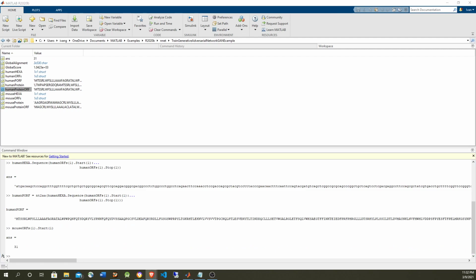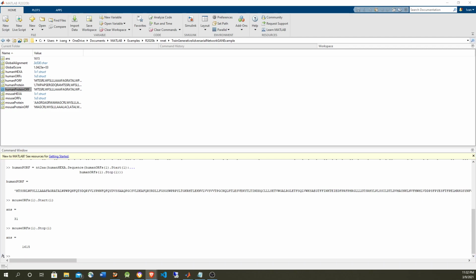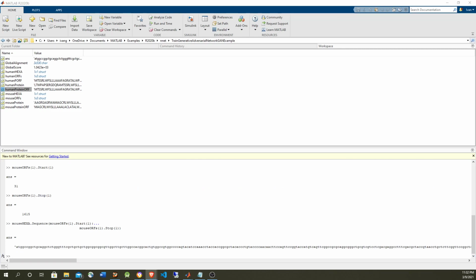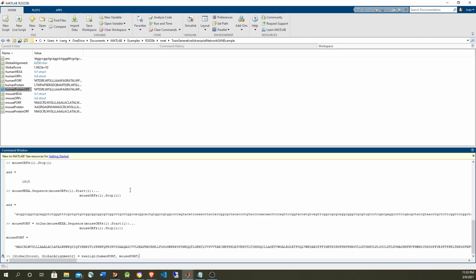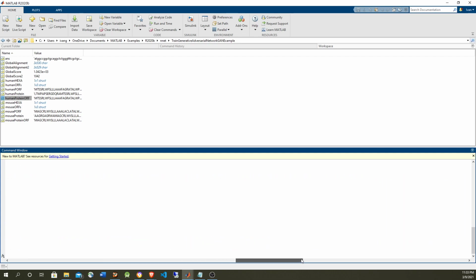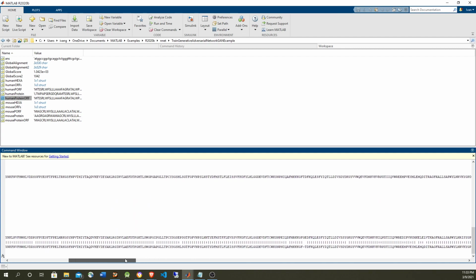Now let's get the DNA for it. This is the DNA for it. And now let's convert that DNA to a protein. Okay, now that we have the protein, let's take a look at how this looks with the protein ORFs, and it looks good. So effectively, the first DNA ORF that we got had a very high matching, as we can see in here.